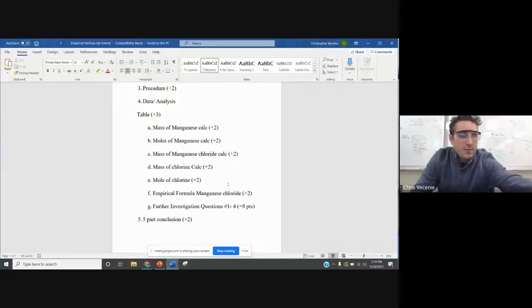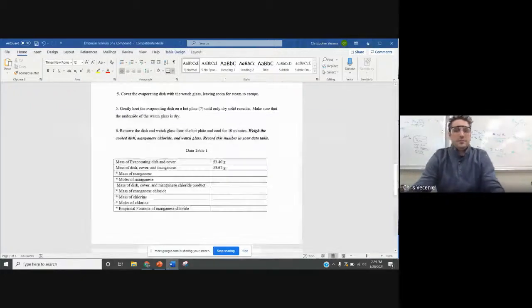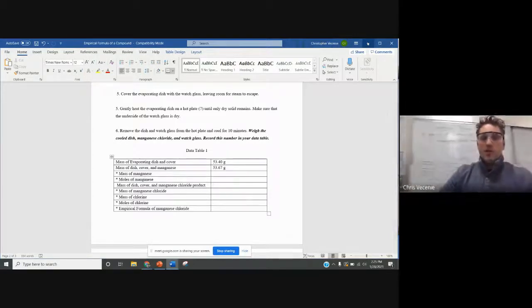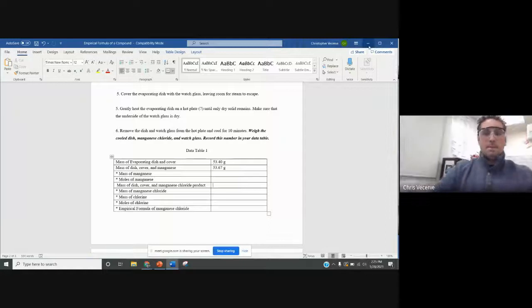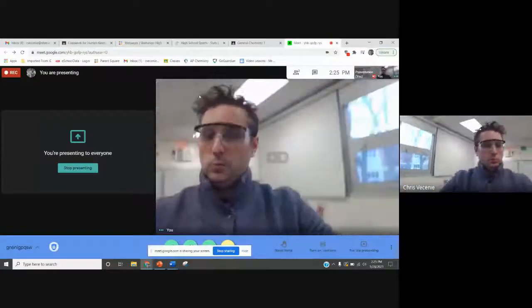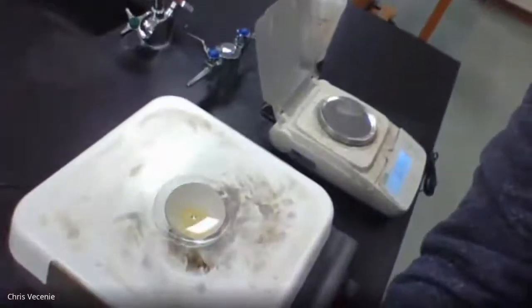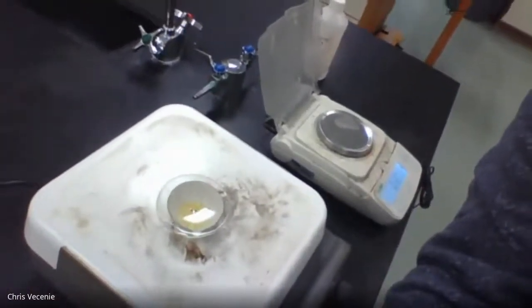All right, so let's pit stop to the back and take a look and see how our evaporation is going. All right, so coming along, but still taking some time to evaporate that out. And it's a process. It takes time.